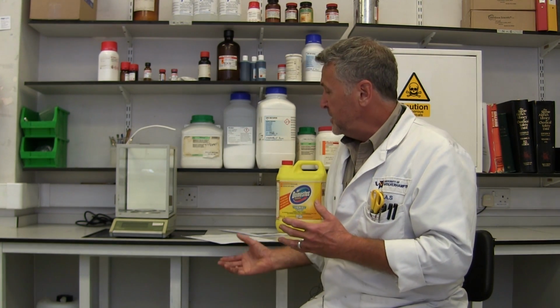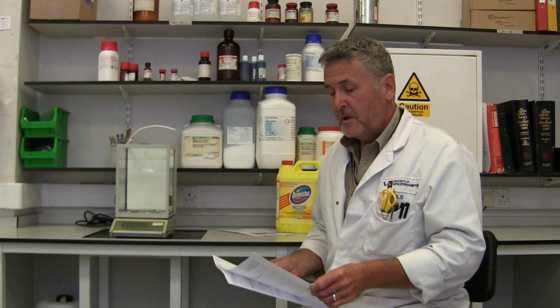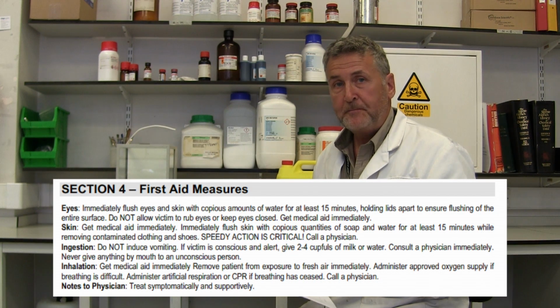That's all you need. What you can then do is look through the data sheet, obtain the information you need, and from that you can then fill out your CoSHH assessment. It's fairly simple. It's even been arranged so that if you look on the CoSHH form, many of the boxes are numbered, and the numbers actually correspond to the numbers on the data sheets that you will read. So for example, if I look on the back, box number 4 is first aid measures. On the data sheets you'll find box number 4 will cover all the first aid measures that need to be included on your CoSHH assessment. It's as simple as that.